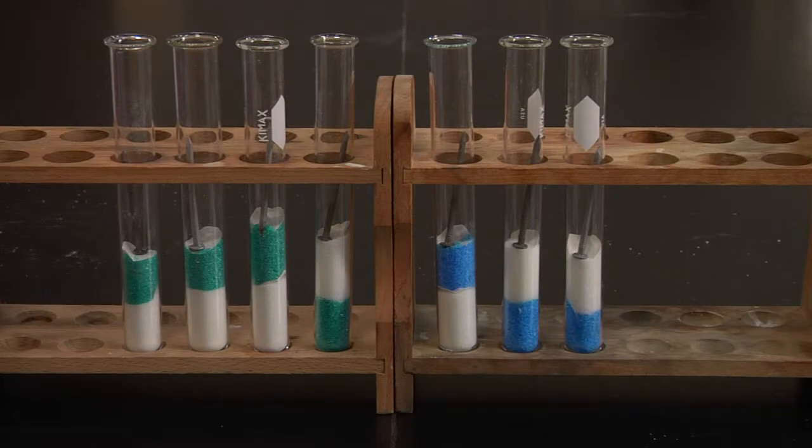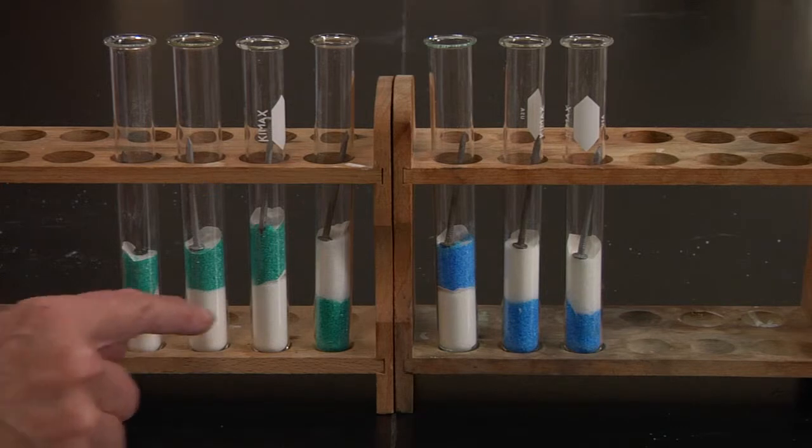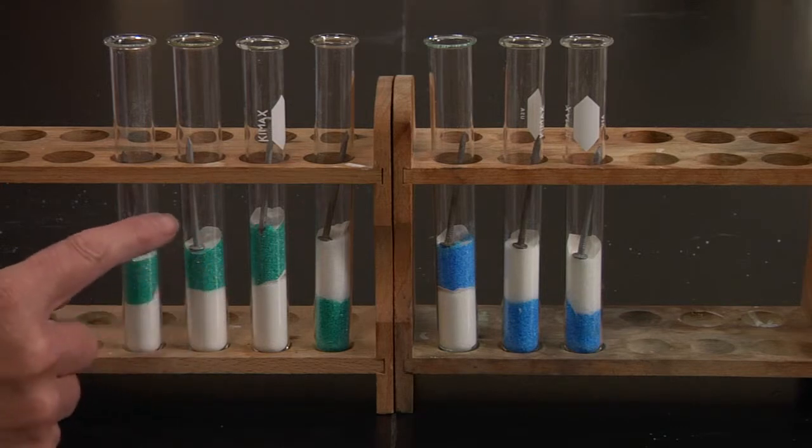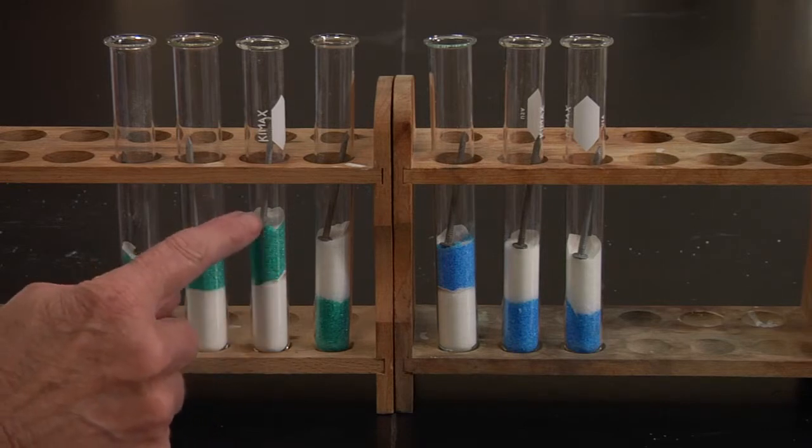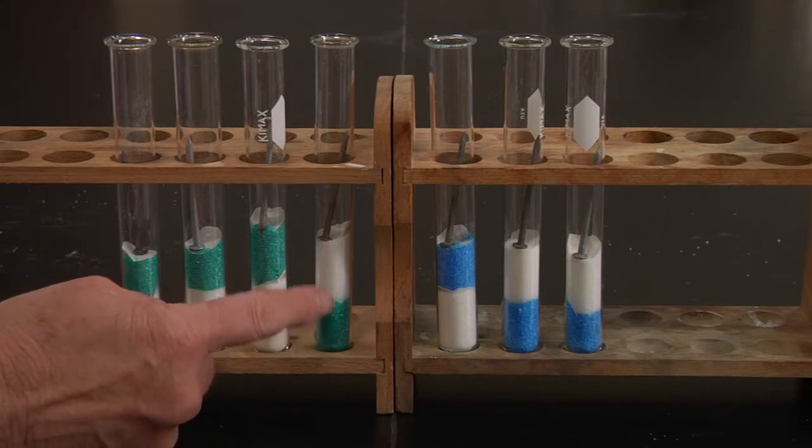Now here we have a number of permutations. Here we have an iron nail with copper chloride at the top and sodium chloride at the bottom. This is the same except it has a galvanized nail. This is the same except it has the nail pointing down. And this one we've reversed the copper chloride and the sodium chloride.